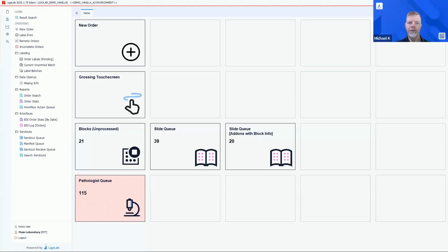Okay, and here's another question. Maybe want to hold this one for a little bit later on, but can you describe the pathologist queue, in particular, all the possible rules for case assignment? I think you have that coming up a little bit later on the agenda, so it's up to you if you want to switch things around or keep the way you planned.